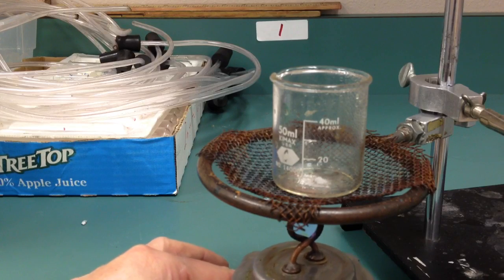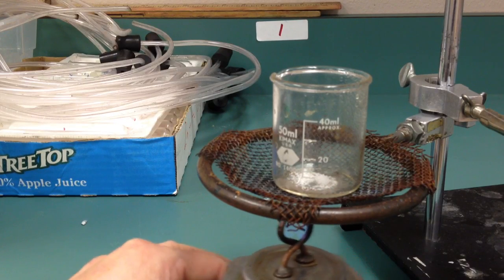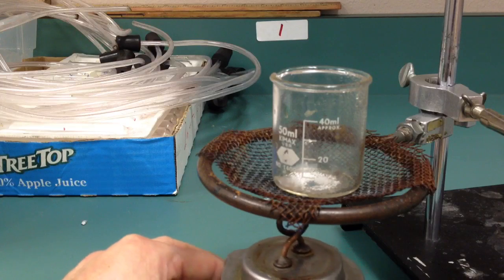You should start to see some white crystals here pretty soon. Oh yeah, right in the middle. Right in the middle you can see it white. Those are the white zinc chloride crystals that are no longer in the liquid anymore. So, you can see them.